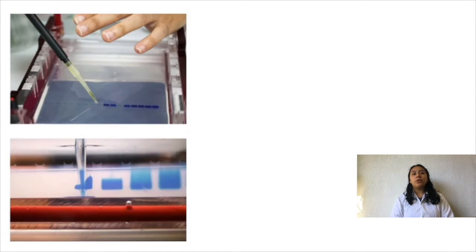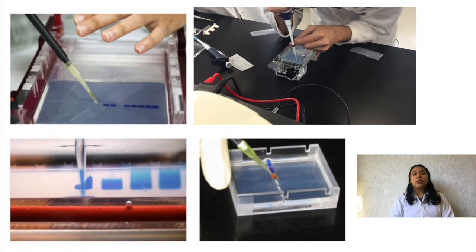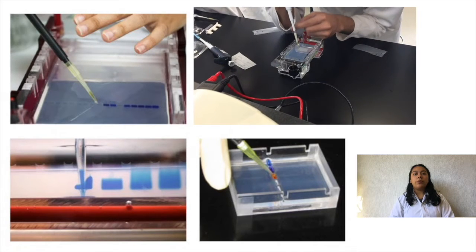One of the mistakes that exists when pipetting samples is to leave samples outside the well, or to perforate the gel with the tip. With the perforated gel, the sample does not stay in the well, or it leaves the gel, just as by not depositing the whole sample inside the gel.